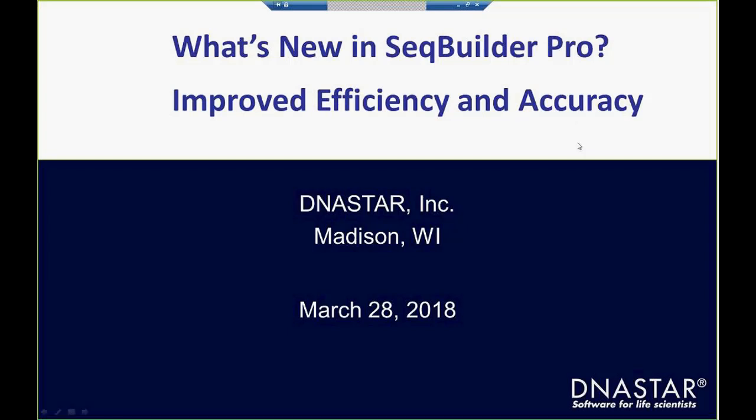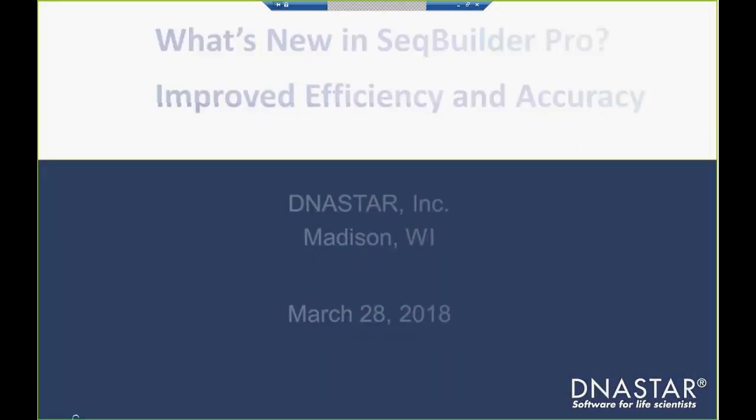We have some exciting new features in SeqBuilder that I can demonstrate to you. So we'll start with a few slides here just to kind of introduce you to some of these new features, and then we'll spend most of the webinar in the software taking a look at them live time.